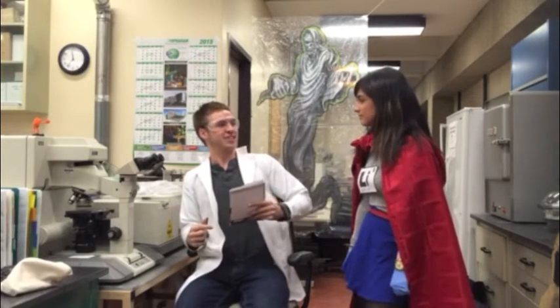Jimmy, I couldn't help but overhear your little problem. Yeah, I can't zoom in anymore on my mouse tissue. It looks like you need the help of a helium ion microscope. Whoa, what's that? I can tell you, but let me show you.